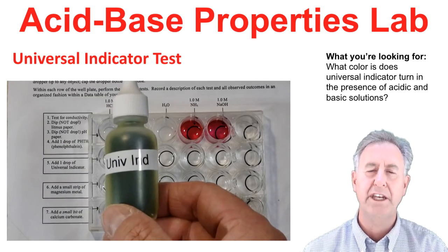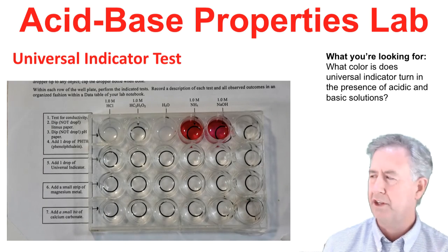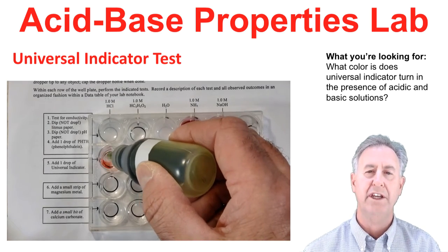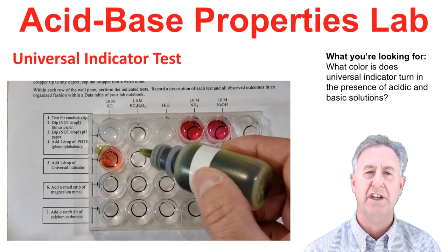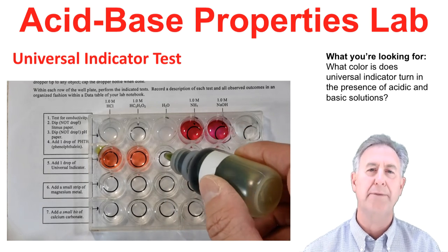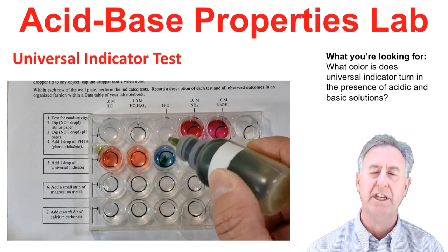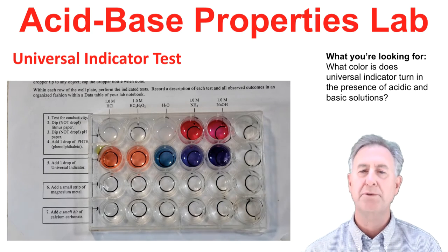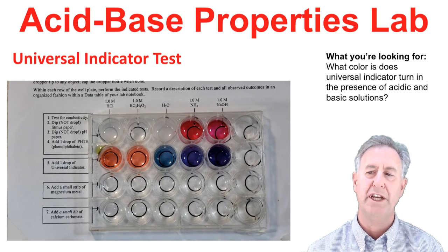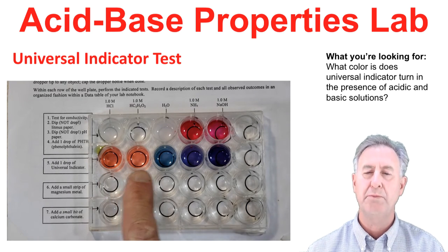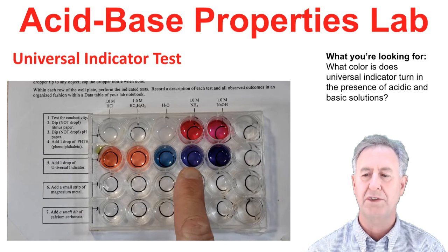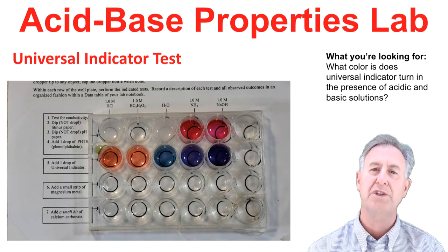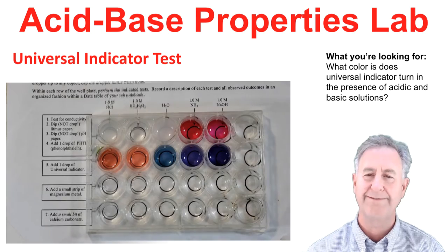Our final indicator test is with universal indicator. Like any indicator, it behaves differently in an acid than in a base. We put a couple of drops in each of our five wells. You'll notice the two basic solutions on the right are purple, and the two acidic solutions on the left are orange. Make observations in your data table.